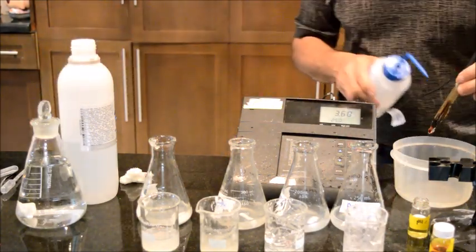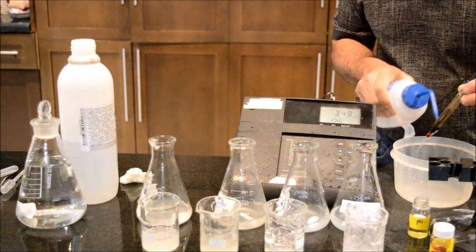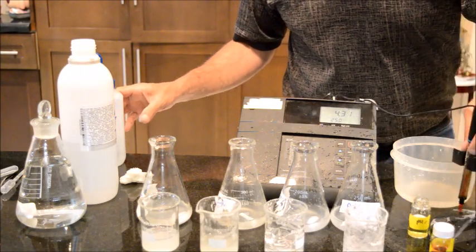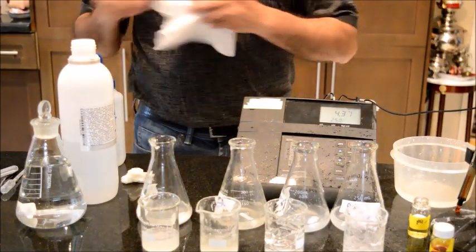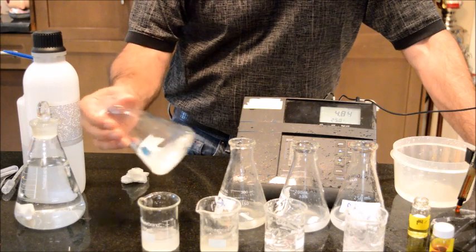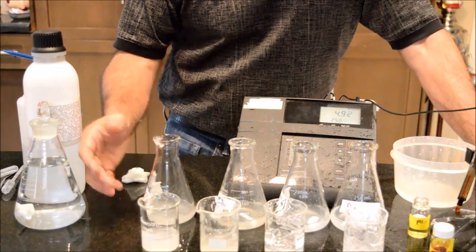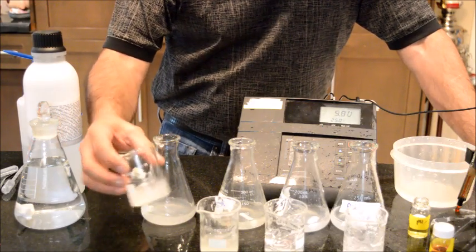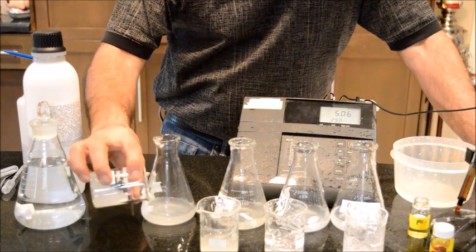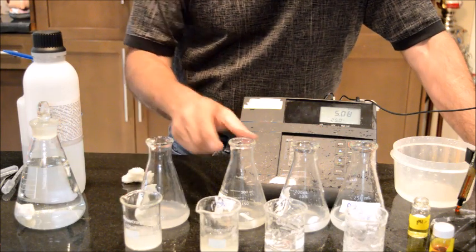There's a lot of gel stuck to my pH electrode. So as you can see, the Xanthan gum initially was pH 5 point something, and with adjustment to pH 4.2 or close to 4, viscosity is more or less the same.